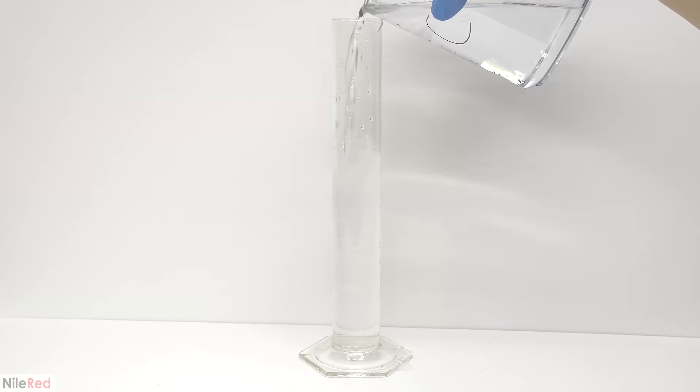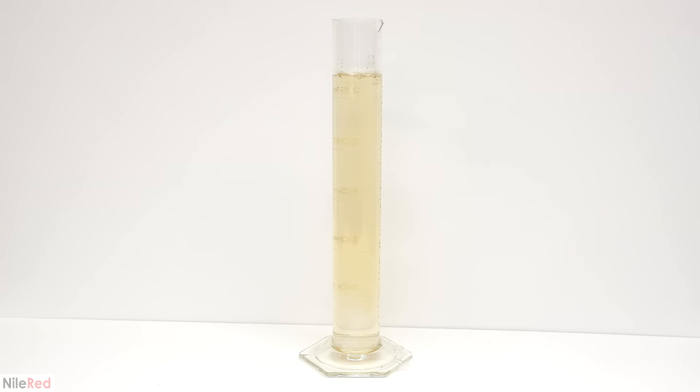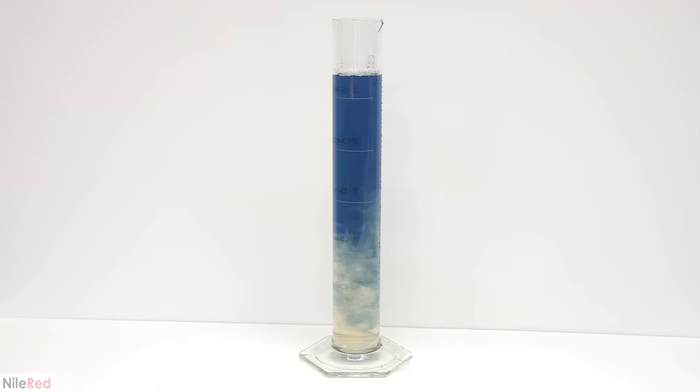In the last run, the reaction seemed to be occurring sooner at the top than the bottom, so I wanted to see if I could exaggerate this effect by using a graduated cylinder. During the reaction, it looked like there was a lot of fluid movement and I think it kind of mixed itself. In the other reaction it maintained a steady gradient from the beginning to the end, but after a couple cycles in this one, it seemed to become more or less uniform.